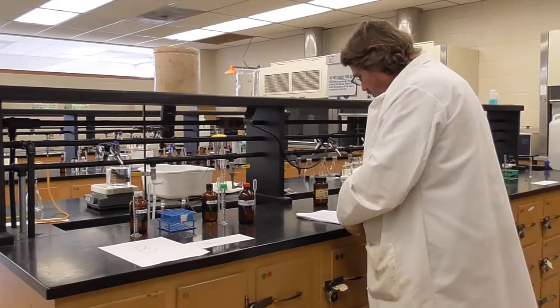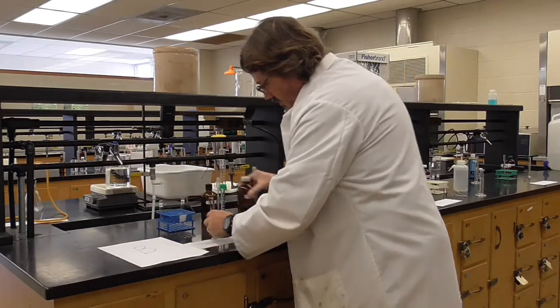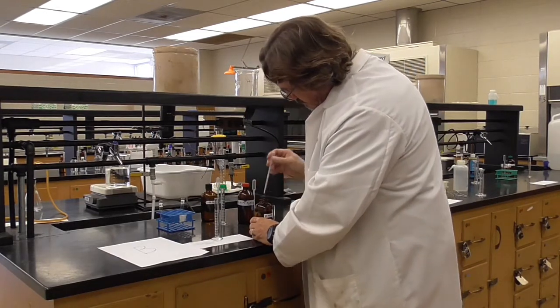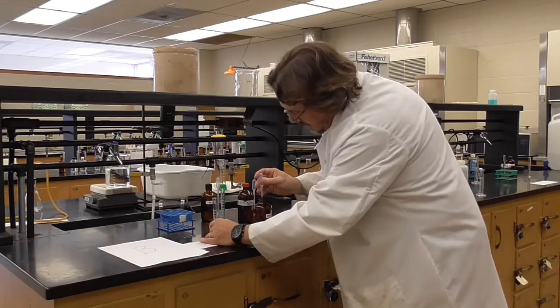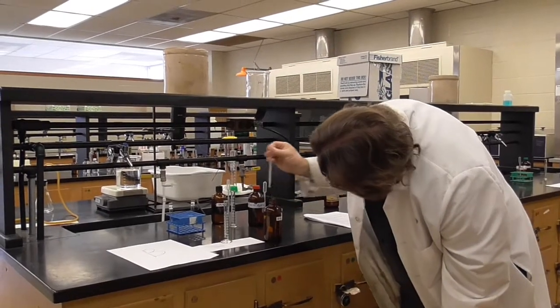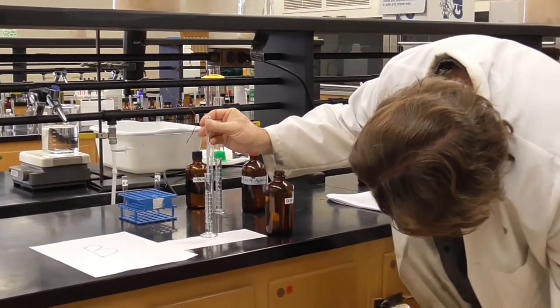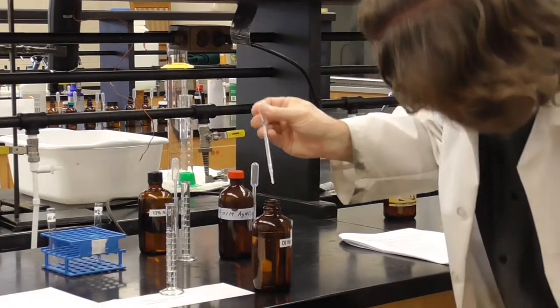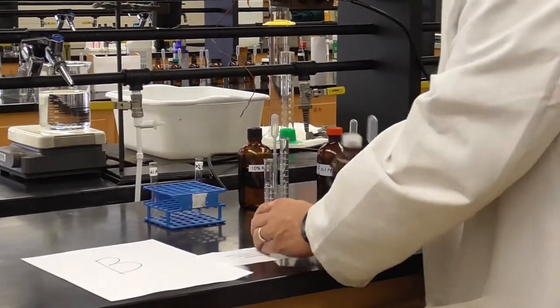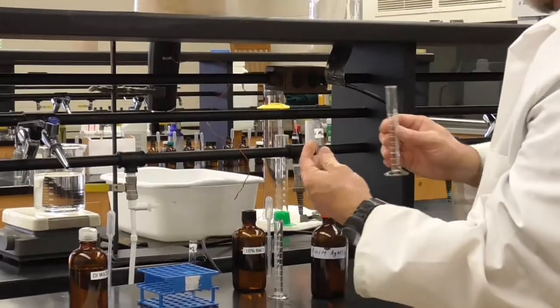All right, following the protocol, it says 3 milliliters into a small test tube for each one. So here's my water. This will be the negative. I want to get right to the 3 mark, and we'll get 3 milliliters using our graduated cylinder. Okay, right there. And pour that into our test tube, labeled DI water.